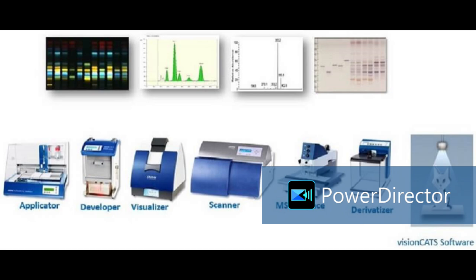Or we have spectra also. We will take spectra of this band, this band, this band, and we will match. We try to match whether they are matching or not. Correlation is good or not. If the correlation is good, for unknown identification, it is very important. Okay. So comparison viewer option is available with our software and visualizer.